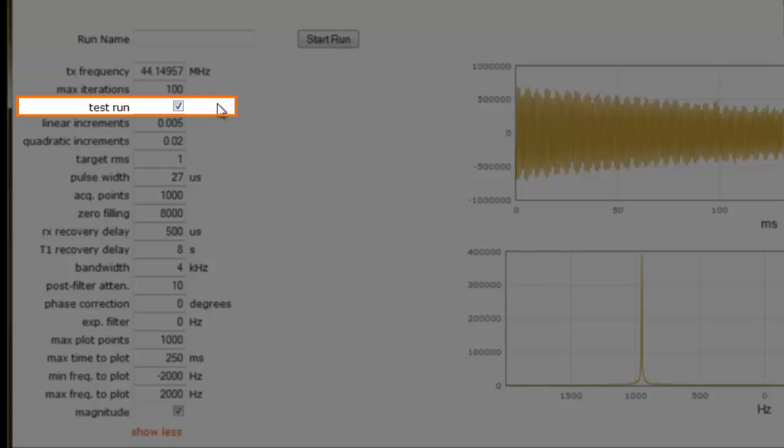This is particularly handy for evaluating the current state of the magnet shim, as well as for discovering and positioning our signal. The next two parameter fields, linear increments and quadratic increments, are the step sizes the algorithm will use to adjust the shim coil current values.